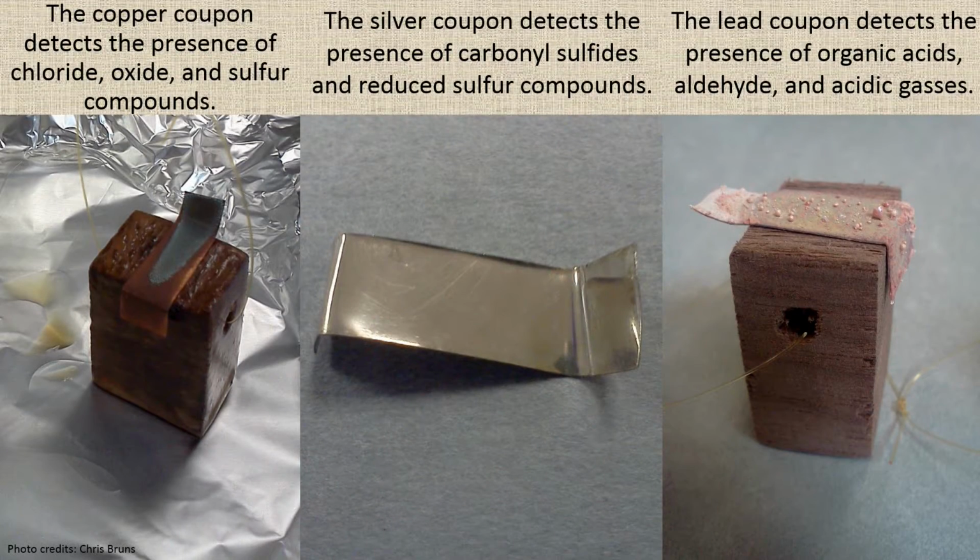So in case this isn't totally obvious, these are the coupons at the end of an Oddy test, and these are the samples. There's no sample in the middle image. After 4 weeks, I remove the accelerated Oddy tests from the oven and open up the accelerated and ambient Oddy tests. Sometimes, as in the photos shown here, the results are very obvious.